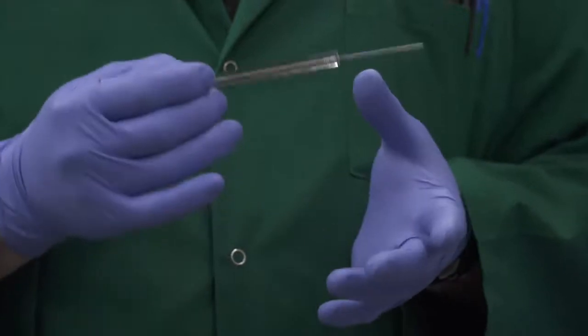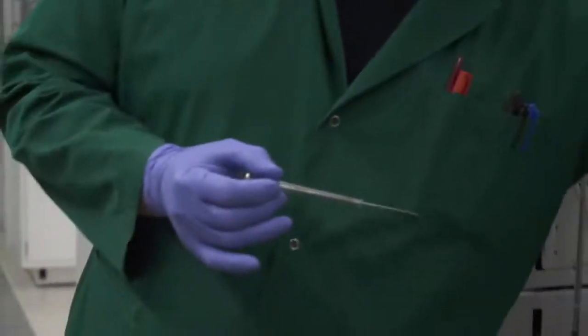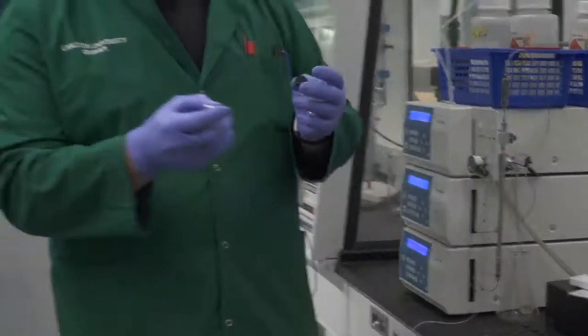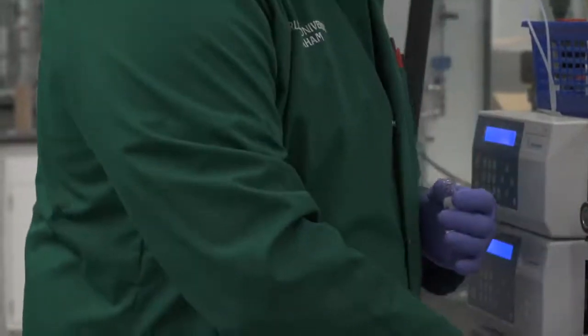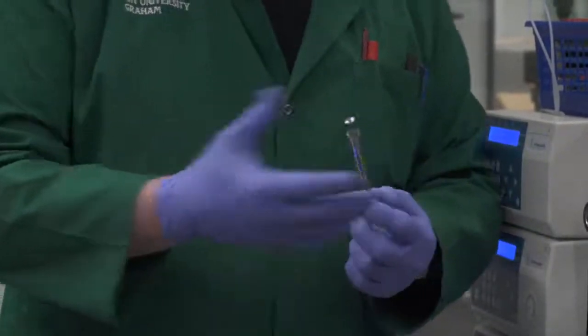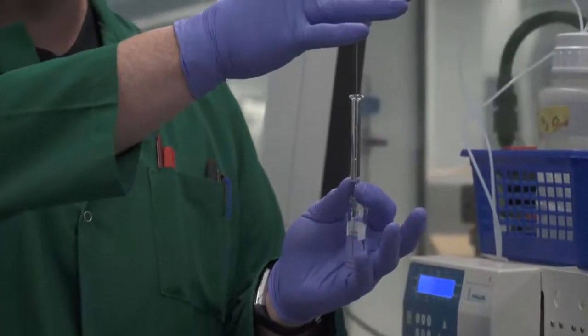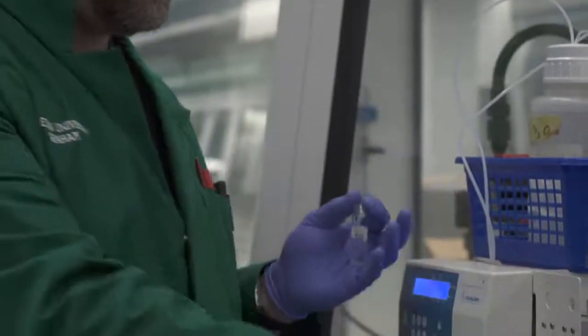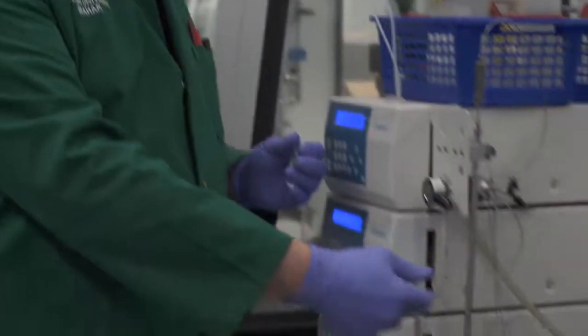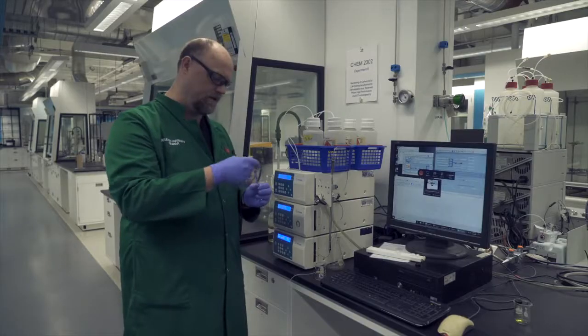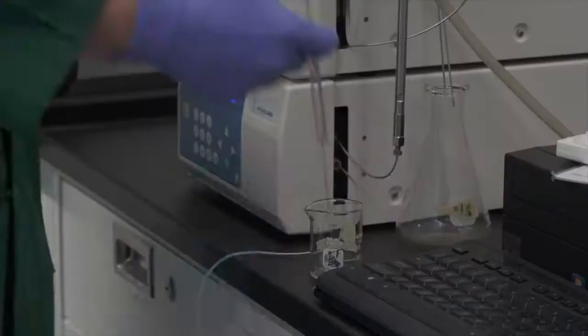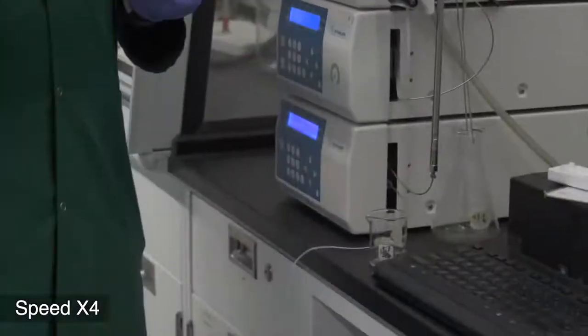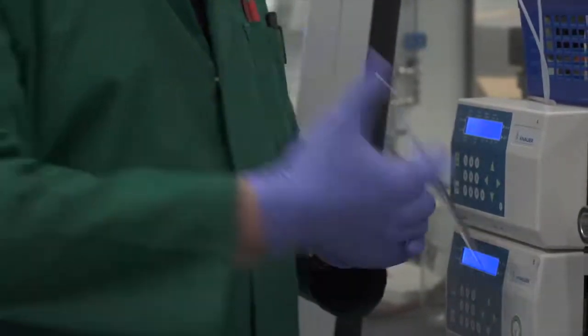The first thing you're going to want to do with that syringe once you've found it is you're going to want to rinse it 15 to 20 times with the solvent that you're going to be using for the experiment. When you rinse the sample, it's as simple as putting the syringe in the solution, drawing up the solution and expelling it to a waste container of some type. And as I said, you're going to do that 15 to 20 times.